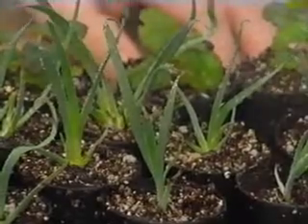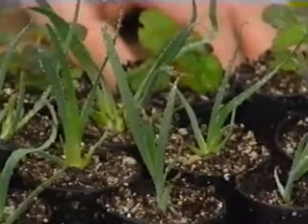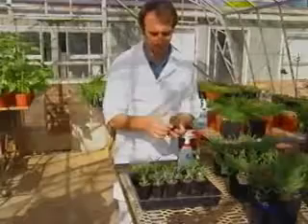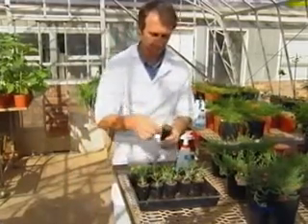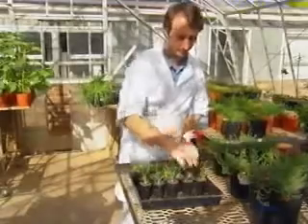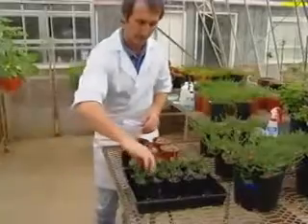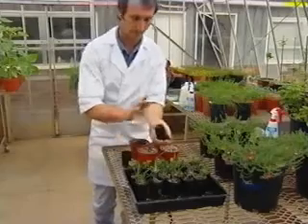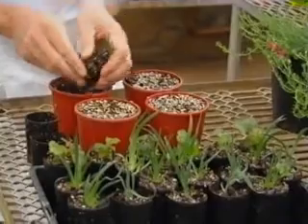The length of time taken to acclimatize plants varies depending on species, but generally it takes between 4 to 6 weeks. Although at this stage the plants are grown under non-sterile conditions, hygiene is still very important. Diseased plants must be eliminated quickly and the area washed with a suitable disinfectant. The acclimatized plants are later transferred to larger pots or to the field as required.